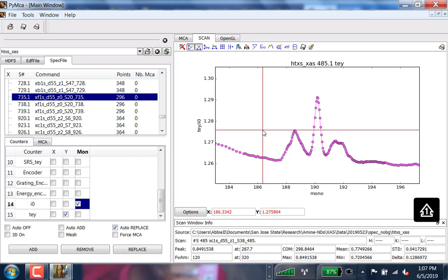Right now, the thing is we don't know what we're looking at. That's kind of the beauty of the whole thing, that we've got a series of different beautiful peaks at 188, 188.6. We've got our strongest peak at 190.2, and another peak here at 191.43, and then another one as well.